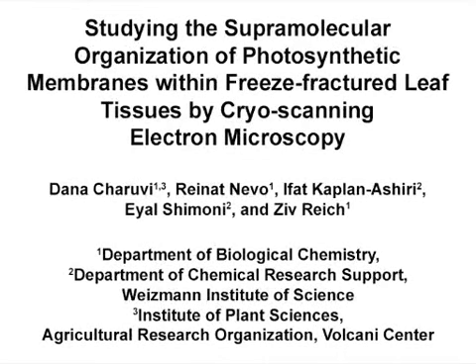The overall goal of this technique is to study the supramolecular organization of photosynthetic membranes using cryo-scanning electron microscopy of freeze-fractured leaf tissue samples. This method can help answer key questions in cell biology, such as the morphological characterization of cells and organelles, the distribution of membrane integral protein complexes, and localization of biominerals.